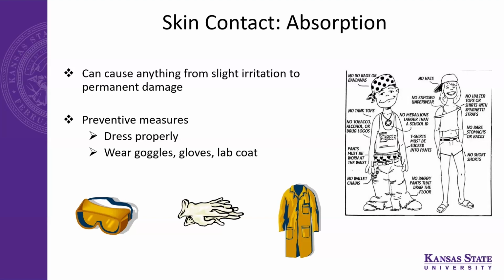When they inverted it, it was not properly sealed, and the acid sneaked through, went inside the glove, and burned the skin. So rather than having those situations, it's always better to follow the safe protocols. That's why we always encourage safety first at all costs in our labs.